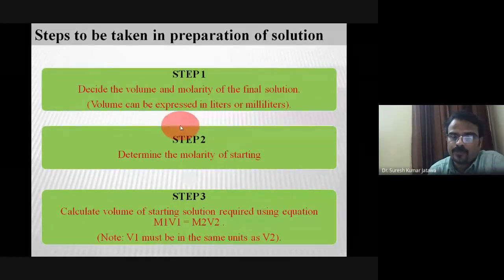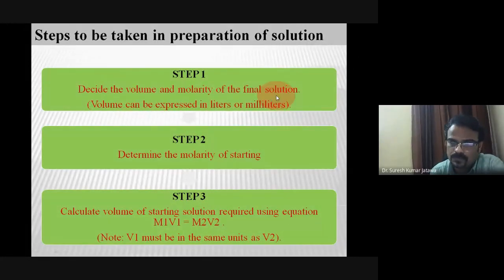So how do you prepare this solution? First you decide the volume and molarity of the final solution. It means you have to decide in which volume and what molarity you want to prepare your working solution. First you decide it and calculate it. Then step 2 is to determine the molarity of the starting solution, which means the molarity of your stock solution.